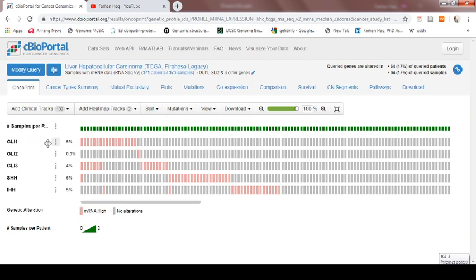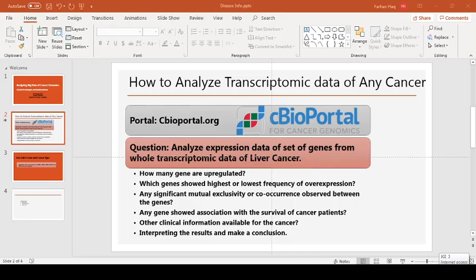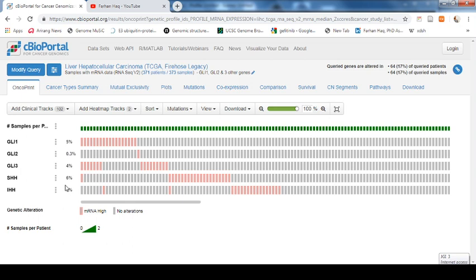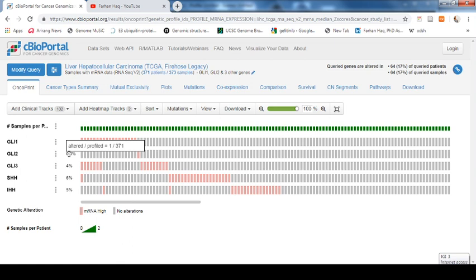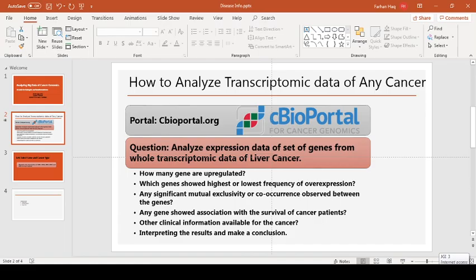Now if we try to answer the questions we put up — for instance, how many genes are upregulated — you can see that all five genes are upregulated but with different frequencies. For example, Gli1 showed 5 percent overexpression. If you hover your cursor here, you can see that altered or profiled means that 18 out of 371 patients showed overexpression or upregulation of the Gli1 gene. And 0.3 percent — that is only one out of 371 patients — showed overexpression of the Gli2 gene. In this way you can see that the data is organized.